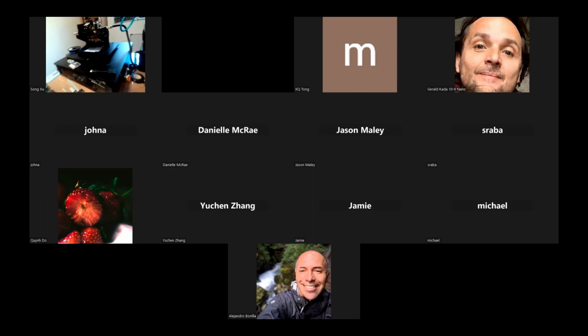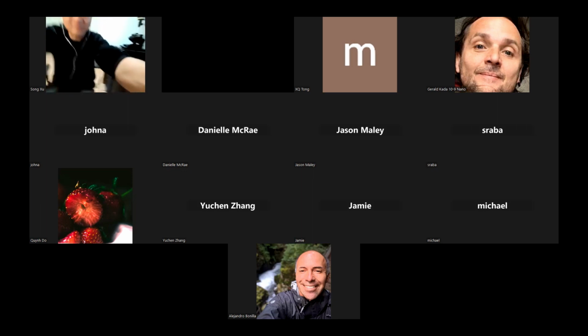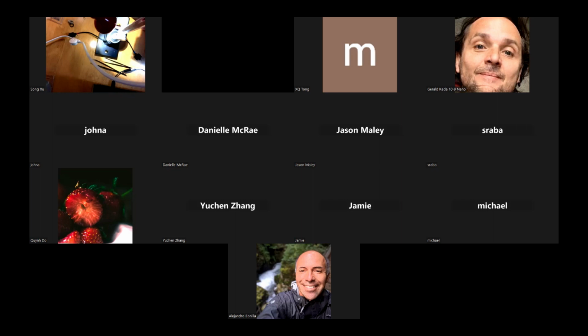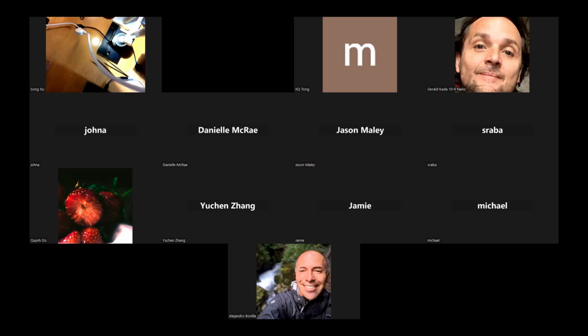Oh, by the way, before I do that, I'll show you the proper way to install your cantilever. Let me change to a different camera. I just installed this multiple camera system, so I can show you different views of different things. Here it is. This is a camera that shows the cantilever, with a light here. It's a scanner on the surface, and I have an optical microscope pointed very close to it. Let me switch to a different view. You can see very, very close to it.